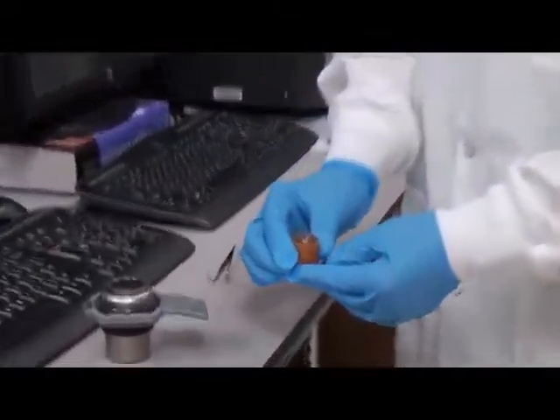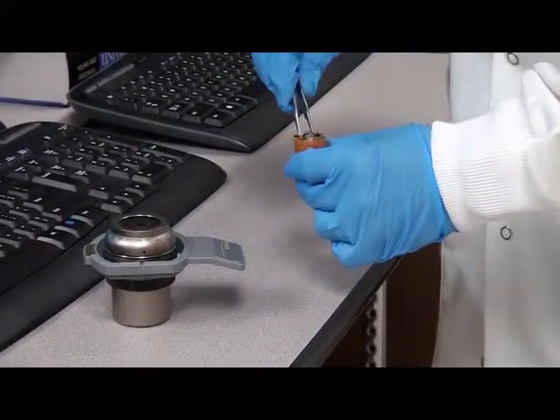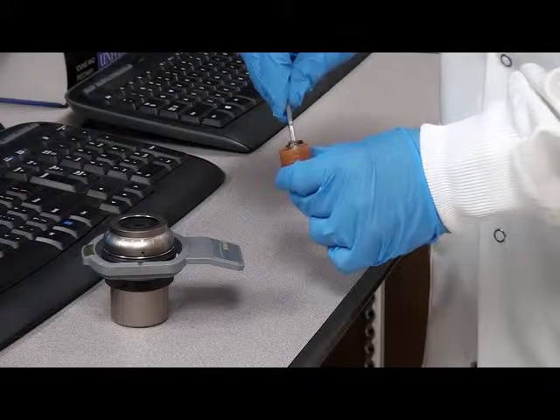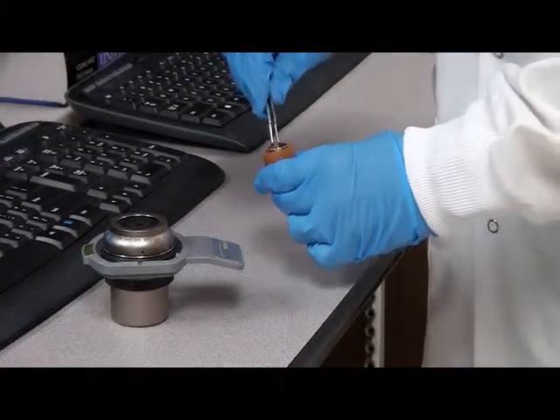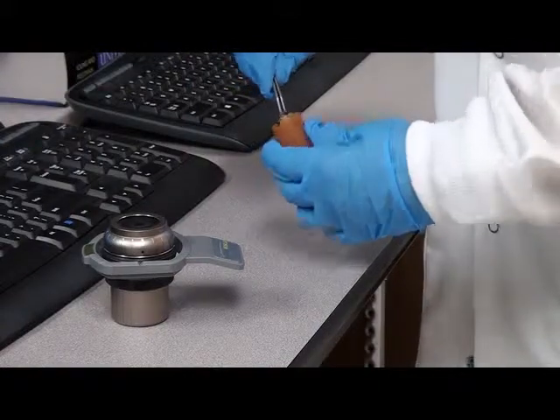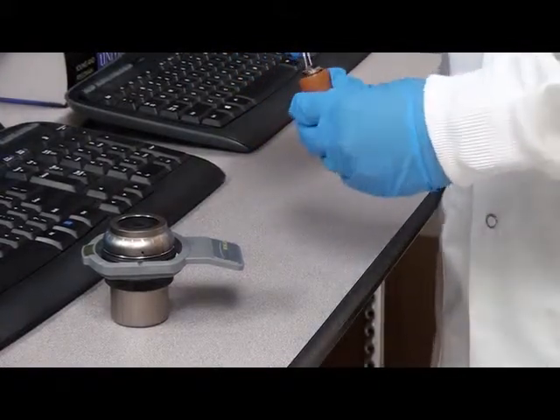Before we take it under the microscope, we have to make sure that the sample is ready to be analyzed. It is very important that the sample is dry and it has a conductive coating.